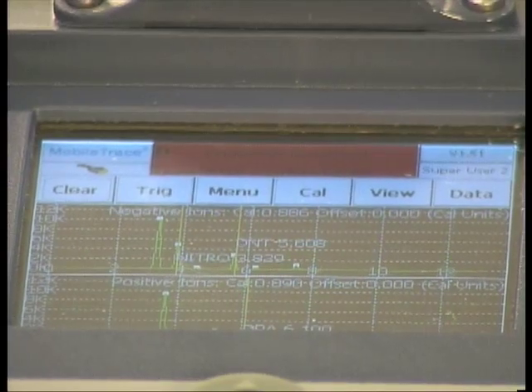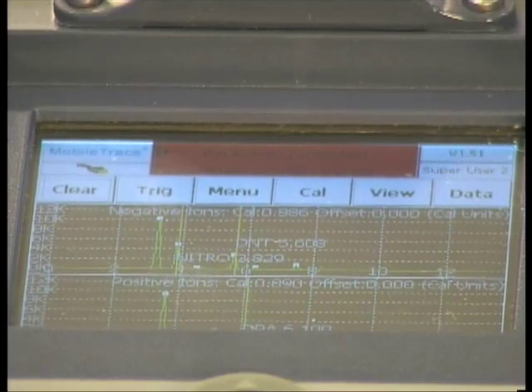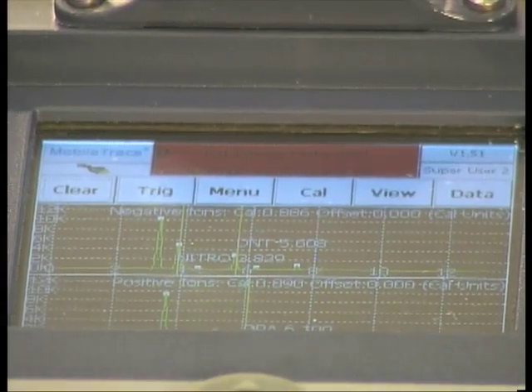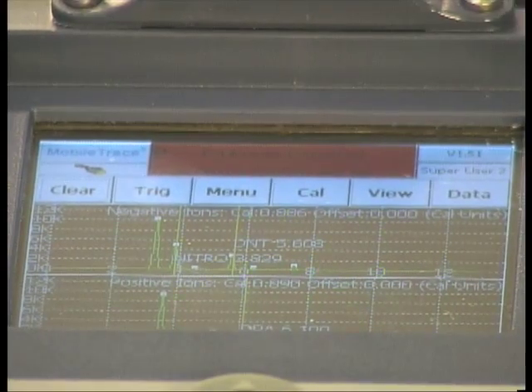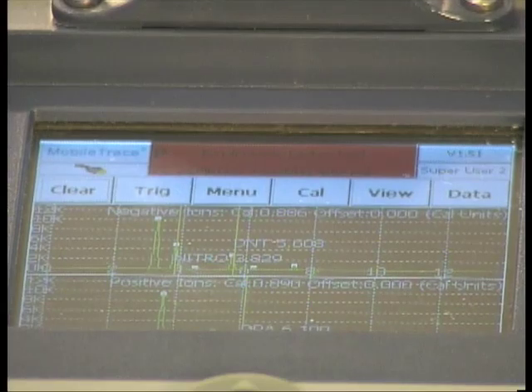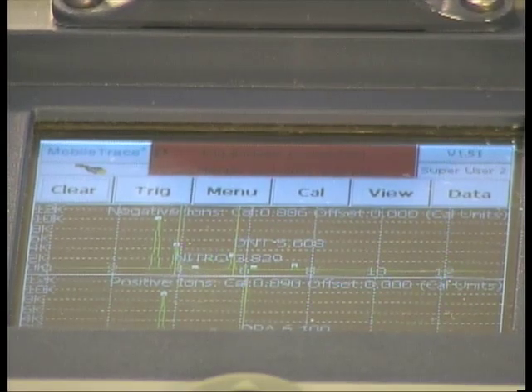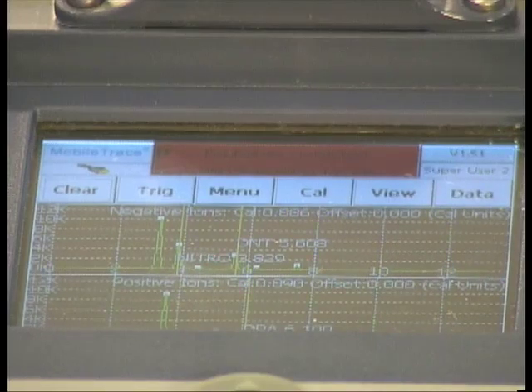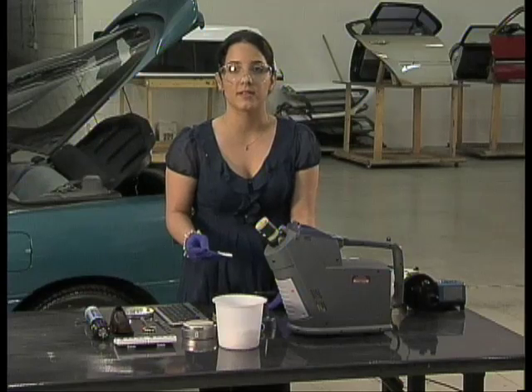In the negative mode we see DNT and the nitro peak. In the positive mode we have DPA. These are all indicators for smokeless powders. This demonstrates that PSPME can be used in large volume areas effectively to sample odors emitted from drugs and explosives.